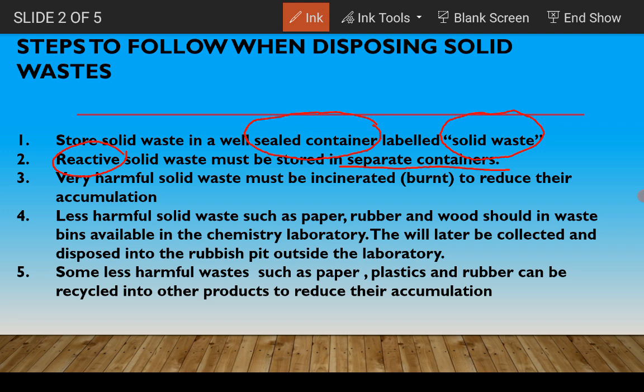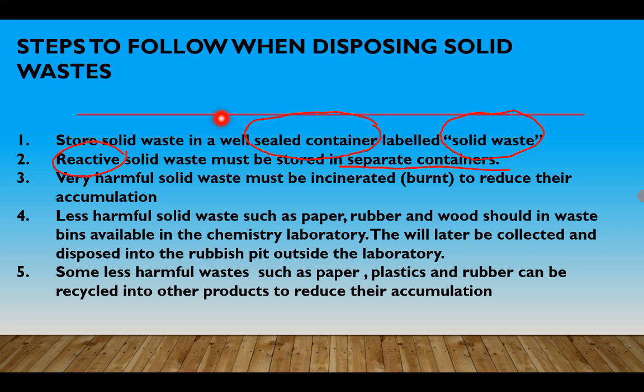That can cause a lot of danger to you, the user, the student, and those that are working in the laboratory. So why separate containers? So that there are no dangerous reactions taking place.